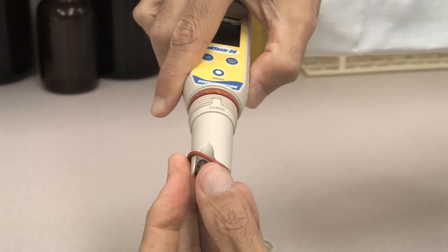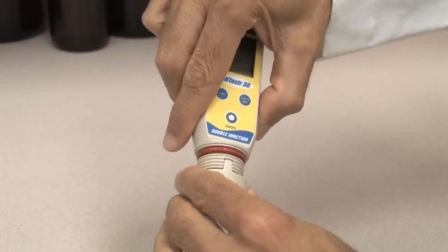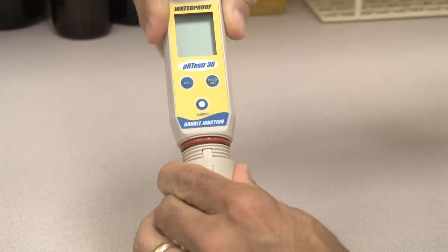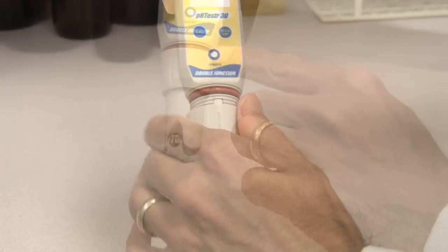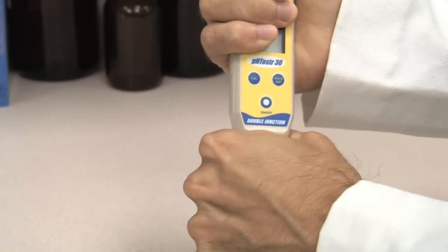Gently push the electrode module into position. Place the small O-ring back onto the new module. Push the collar over the module, threading it into place by firmly twisting it clockwise. Stop when the large O-ring is no longer visible. Do not over twist.